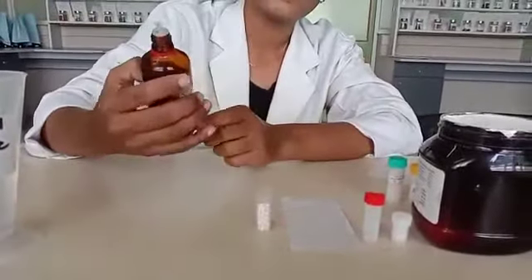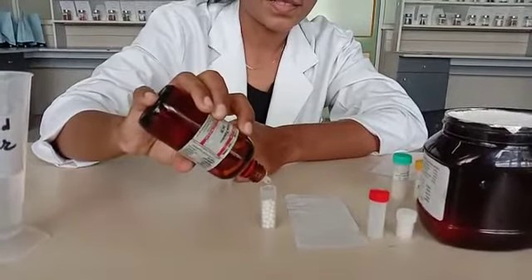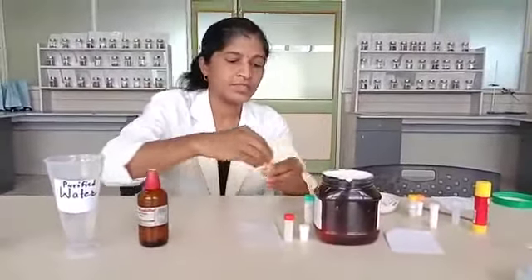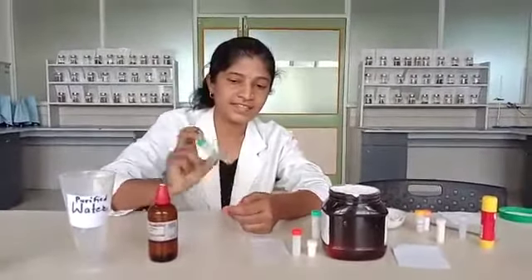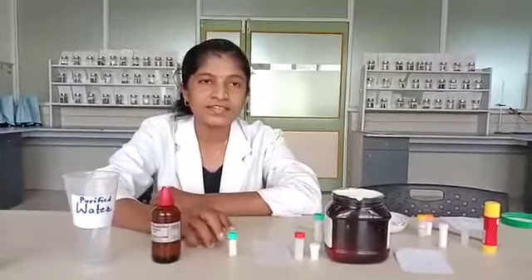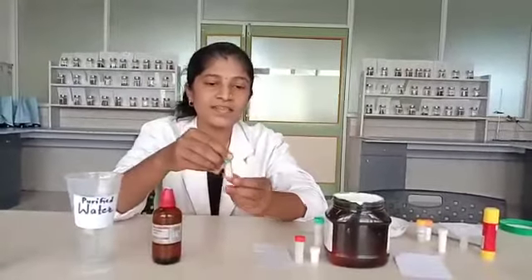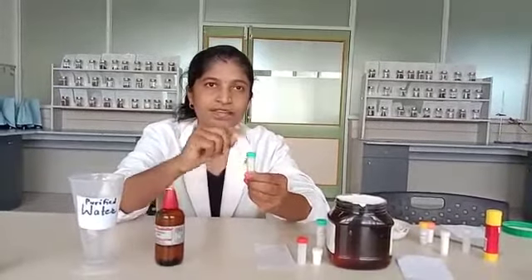We put four to five drops of Lachesis 30 until the globules get moistened. Close the bottle and shake it until uniformly moistened. Keep it for eight hours until the liquid potency is uniformly soaked by the globules. For dispensing, give three to four or five medicated globules per single dose, followed by repetition as the physician requires.